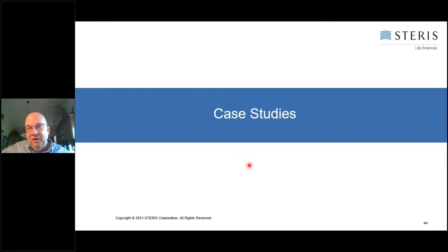Now I want to get into one of the most important aspects of that disinfectant validation program, and that is the case studies, also called the field trials. So let's take a deeper dive here.